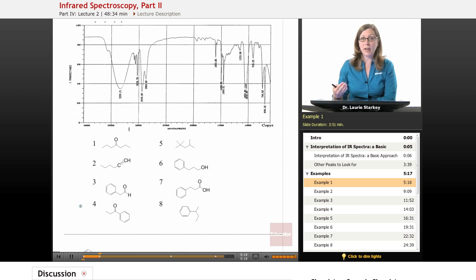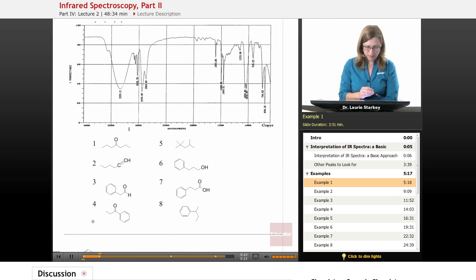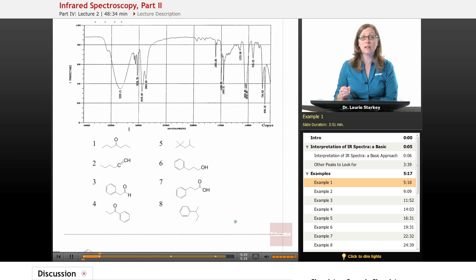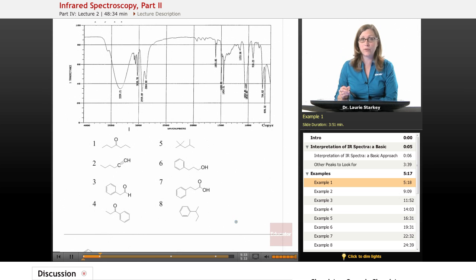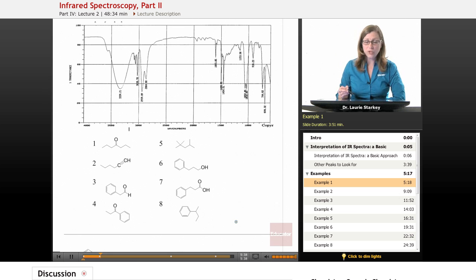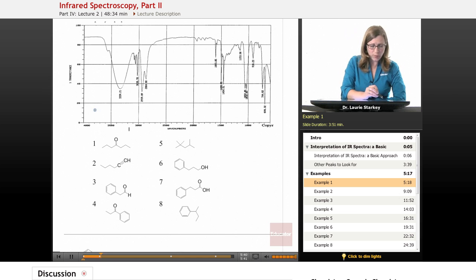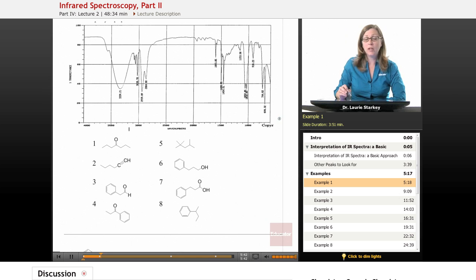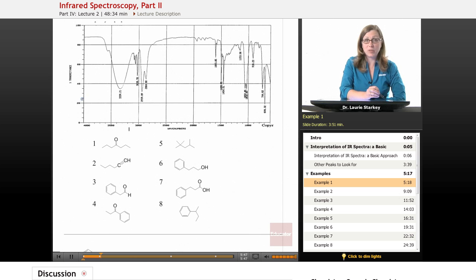Let's get started with our first spectrum. Shown here are eight compounds that we've already analyzed and predicted the peaks for, because it turns out the spectra we're going to be looking at from this point forward actually match one of these. Let's see if we can interpret the spectrum and find out which structure it matches. We're going to read it from left to right, just like a sentence, and start by looking for our obvious peaks.